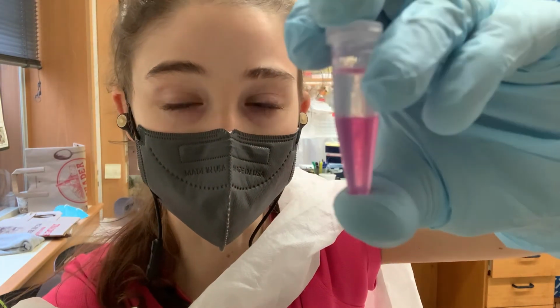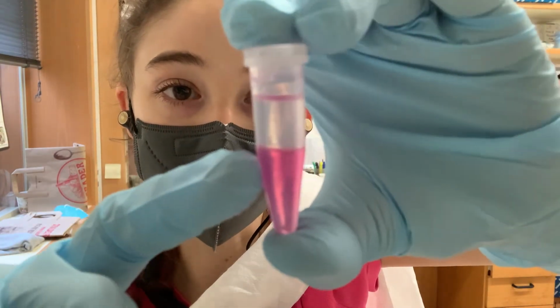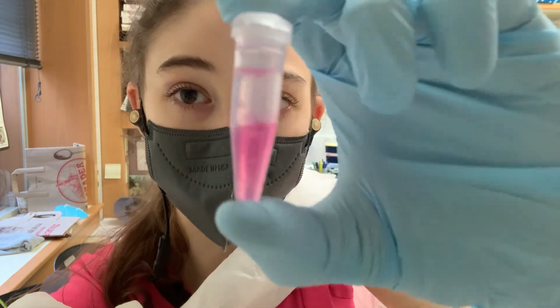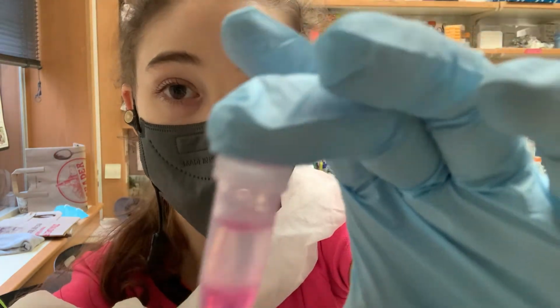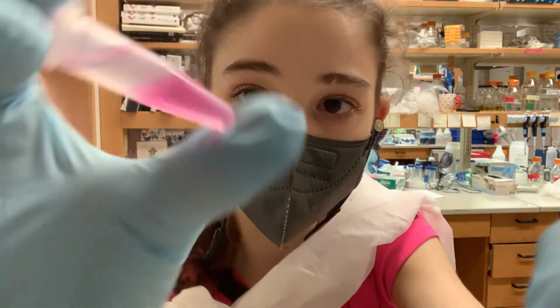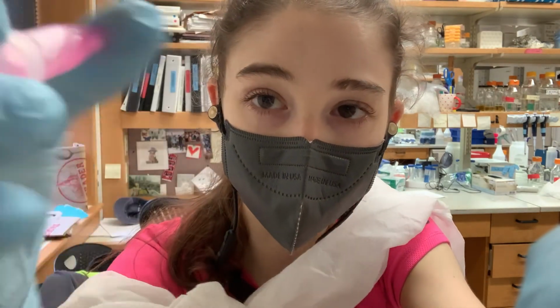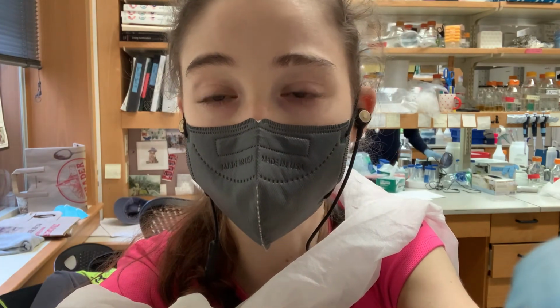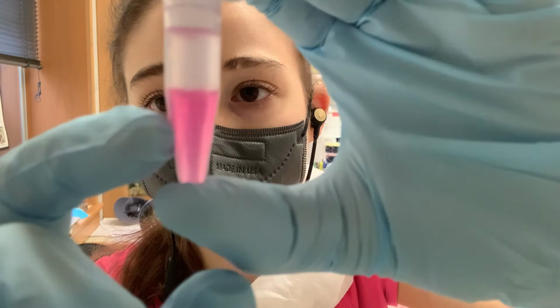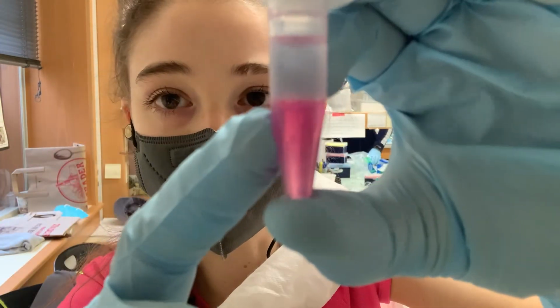So you can see that we have these two distinct layers, and this is because these liquids are immiscible, kind of like oil and water. When we talk about solubility for solid things, for liquids we can talk about miscibility. If two liquids are completely miscible, then they'll completely mix together. But you can see that these are immiscible, so they're not mixing together.